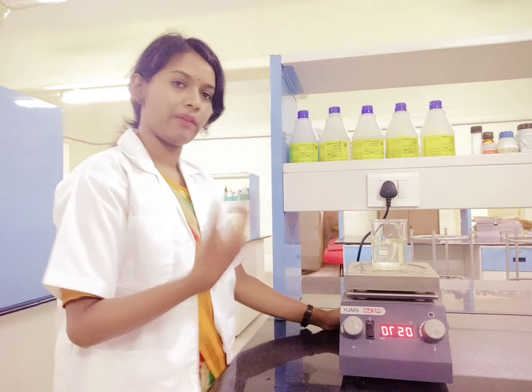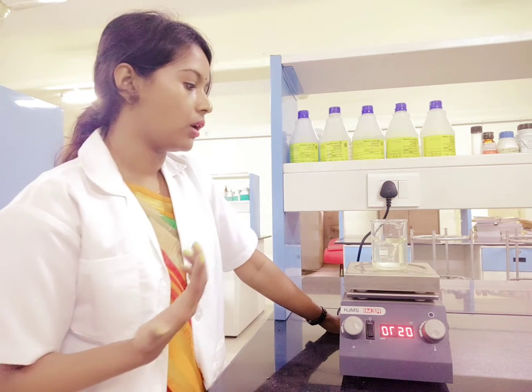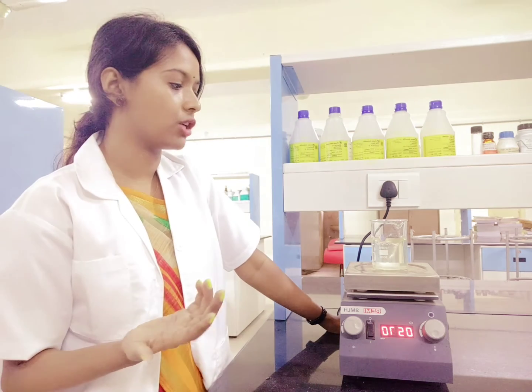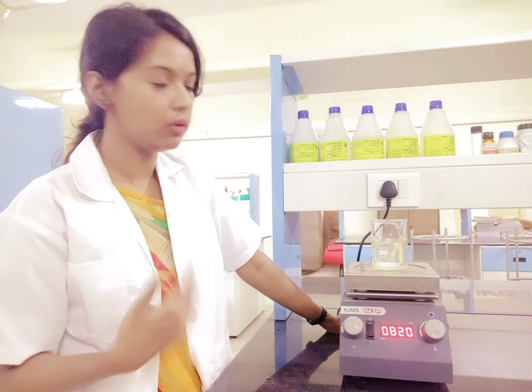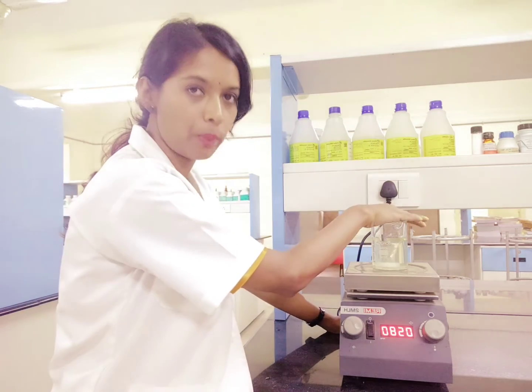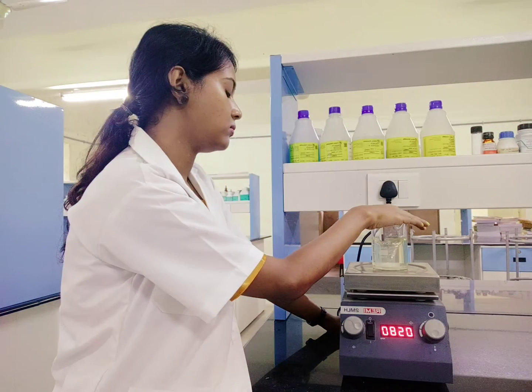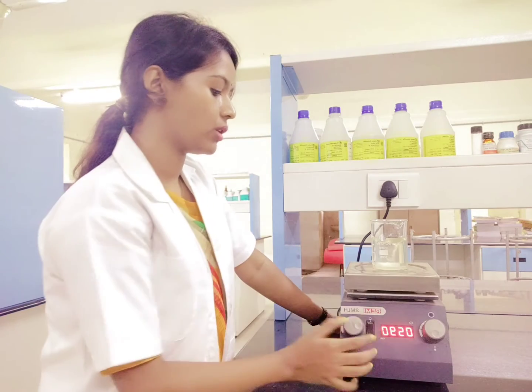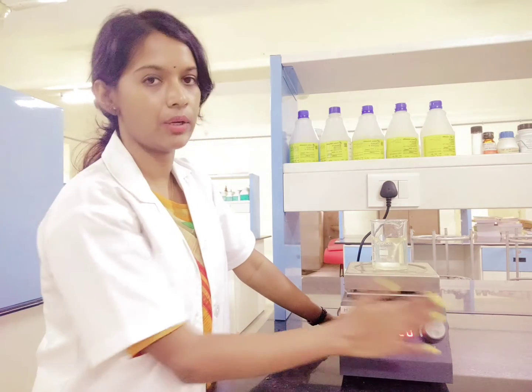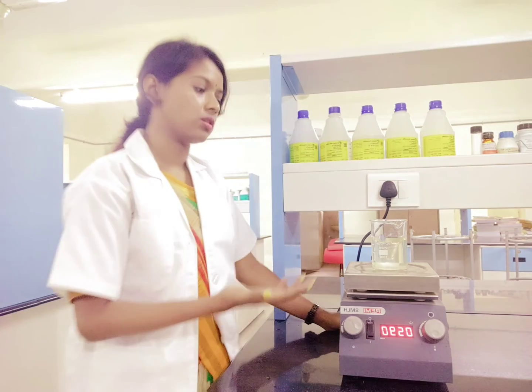Sometimes for extraction — as I was saying about anthocyanin extraction — depending on how much time you want for the extraction, you can even keep it overnight if you want proper extraction. You just take the food sample, add the solvent, and close it properly so that the solvent does not get evaporated. Close it with aluminum foil, then set your desired RPM and, if required, set the temperature and leave it overnight. The next day you can see that the food sample has completely released the components present in it.